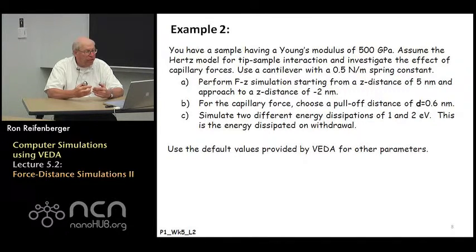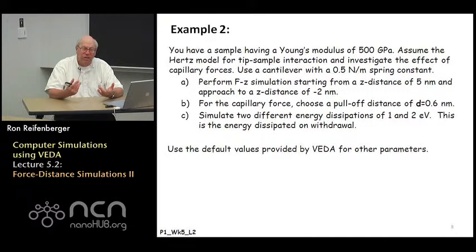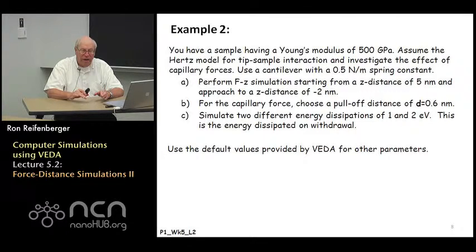To use this capillary model you have to specify the pull-off distance d between the tip and the substrate — in this case 0.6 nanometers. You also have to specify how much energy is dissipated when the tip pulls the water neck between the tip and substrate. We're going to select two values, one and two eV, to characterize this dissipation energy. All other parameters use the default values provided when you bring VEDA up.